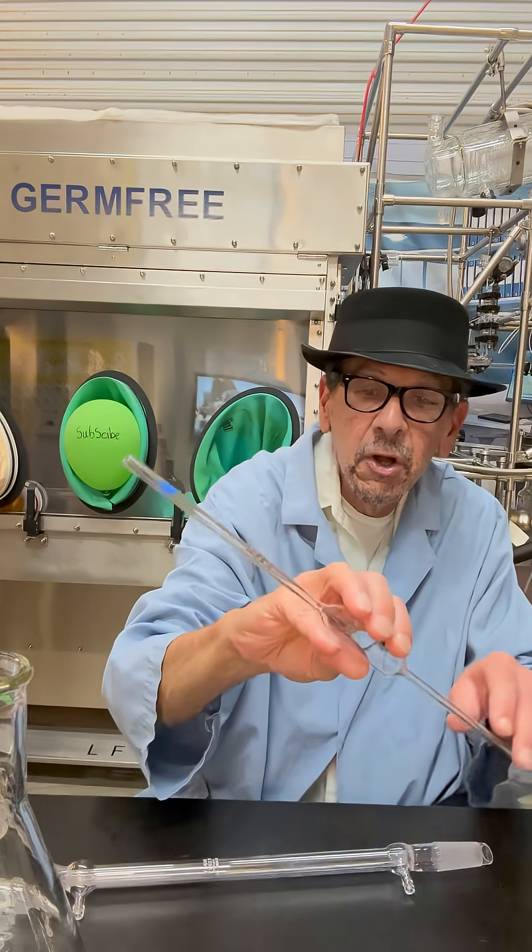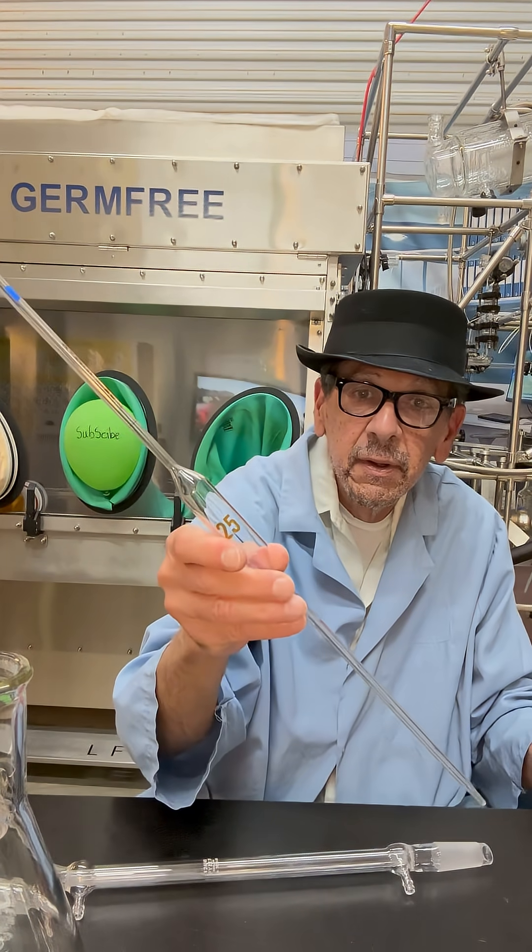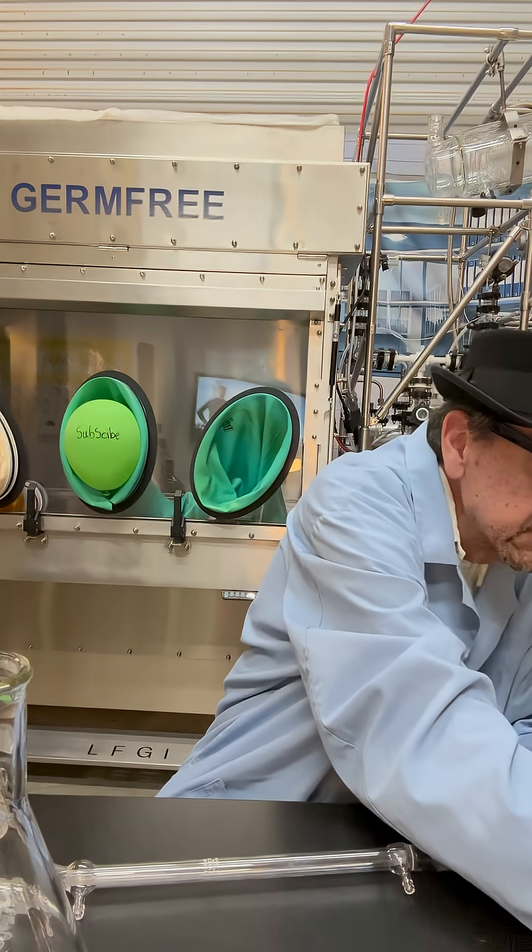This here is called a volumetric pipette. It can deliver 25 mils.